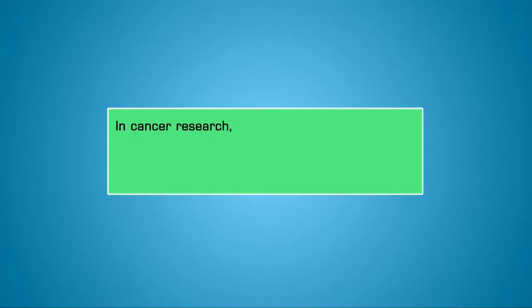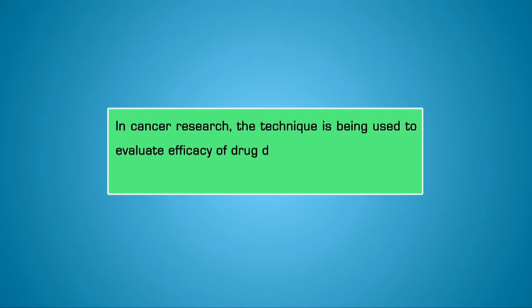Since they do not require the use of animals and are relatively inexpensive, as well as it enables screening of a large number of drugs, the technique is being employed in a wide area of research over recent years. In cancer research, the technique is being used to evaluate efficacy of drugs during drug screening and development.